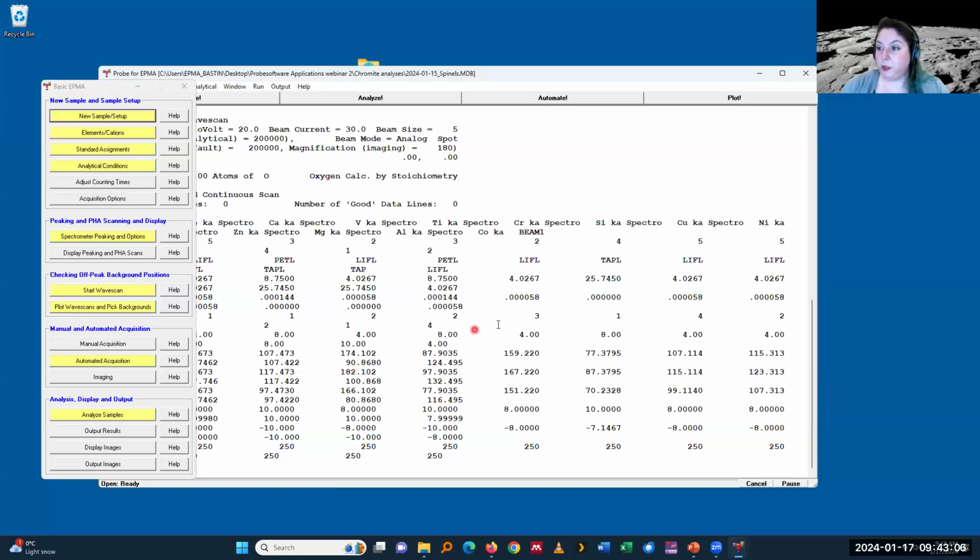Okay, so that was a speed run through many options. But again, if you have routine analysis, it does all the things that you want, but it also records all the data. Everything is saved in a single file, including the standard acquisition data. But if you want to push it, if you really want to check things, all these options become very important. Again, this does not replace a training. We have a YouTube channel that goes into more details.